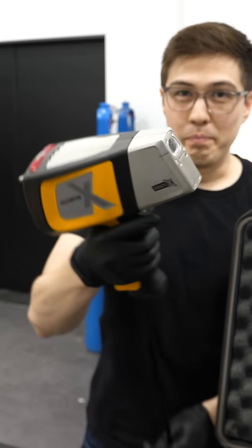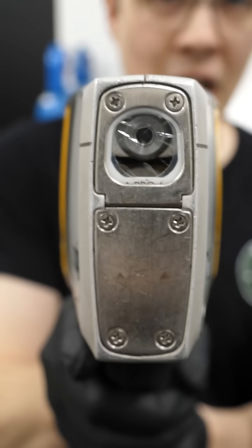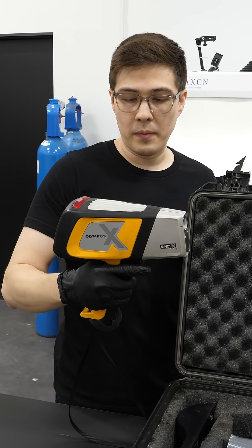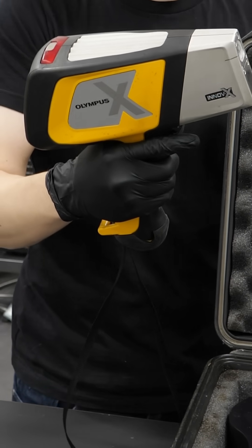Instead of shooting bullets, it shoots x-rays, which is why it's called an XRF gun, which stands for x-ray fluorescence. And technically it's not called a gun — it's an XRF analyzer.